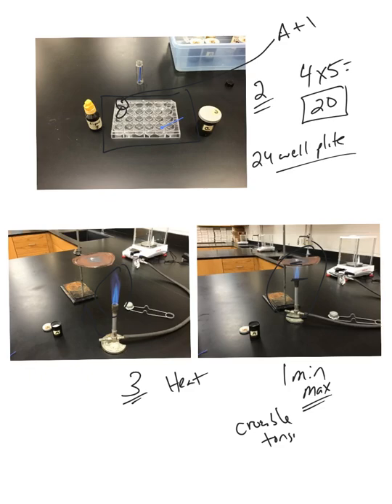And that's what you must complete in day 1. So you've got about an hour to do that. Physical appearance should take no more than about 5 minutes. The individual liquid testing of each of the substances is going to take you a little bit of time. And then heating might take you the most time, because you have to heat each individual powder separately and light a Bunsen burner. But the goal here is to get through all of this in day 1.